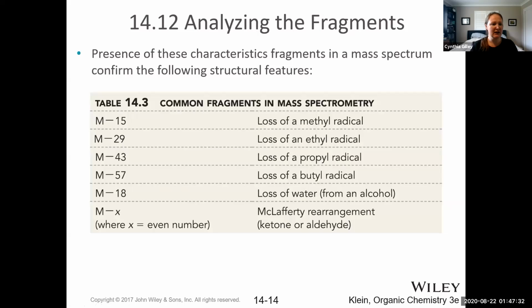So the book, if you're reading the chapter on mass spectrometry, talks a lot about fragmentation patterns. So where can molecules commonly fragment? What sort of things are easily lost from a molecule? And what functional groups can you see some common fragments? We're not going to do a fragment analysis. There's a reason for that.